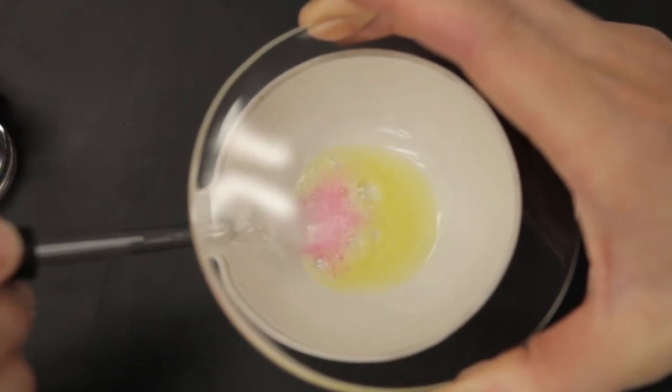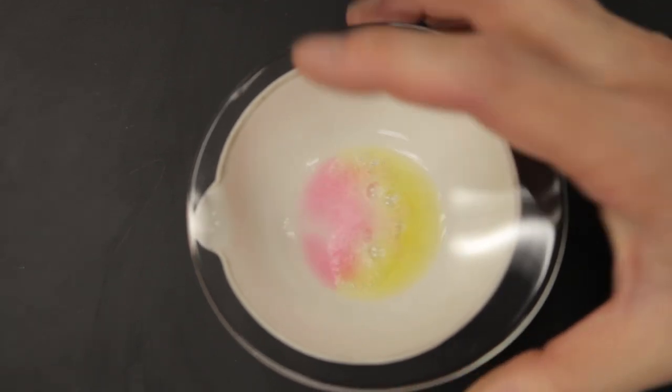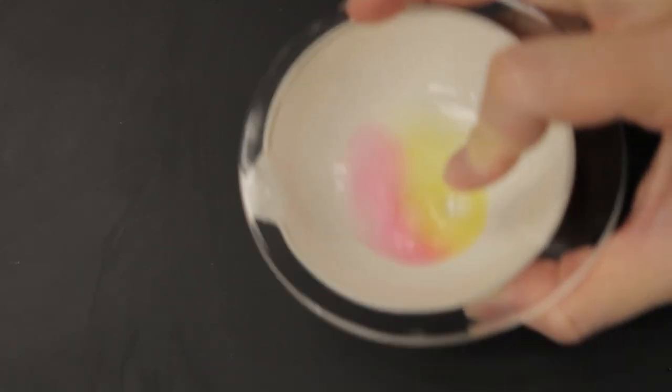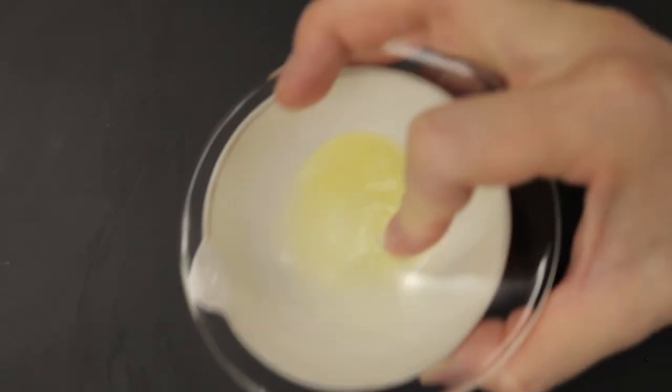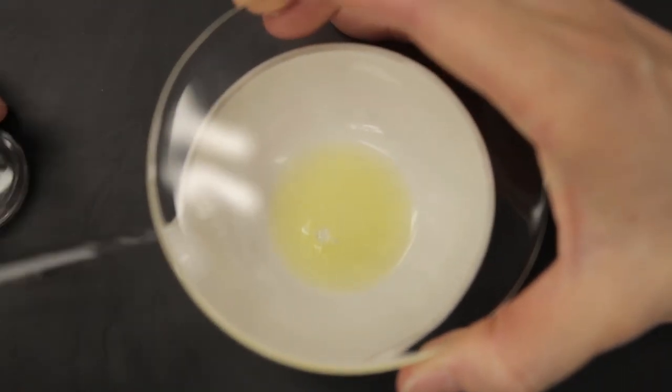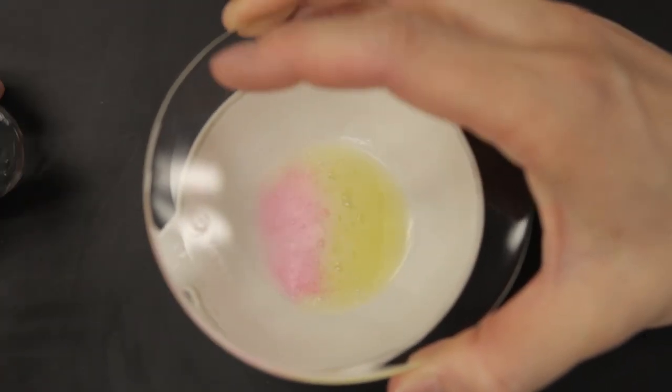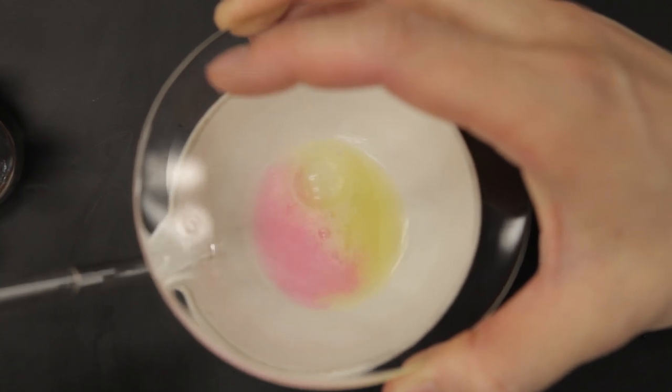Add the 3.0 molar hydrochloric acid dropwise using a medicine dropper down the spout of the evaporating dish without removing the watch glass. Add the hydrochloric acid until the solution is faint pink.